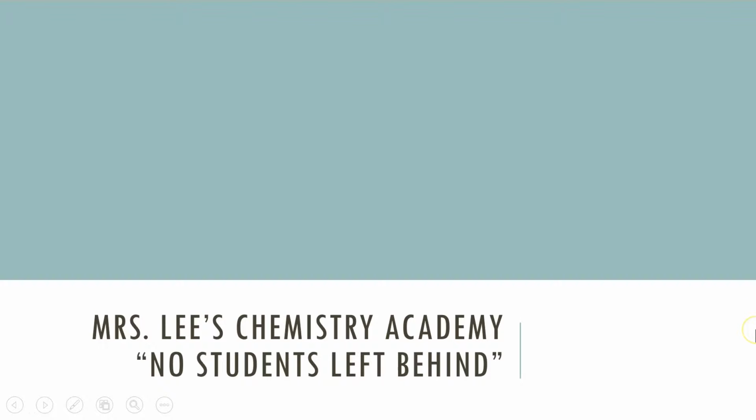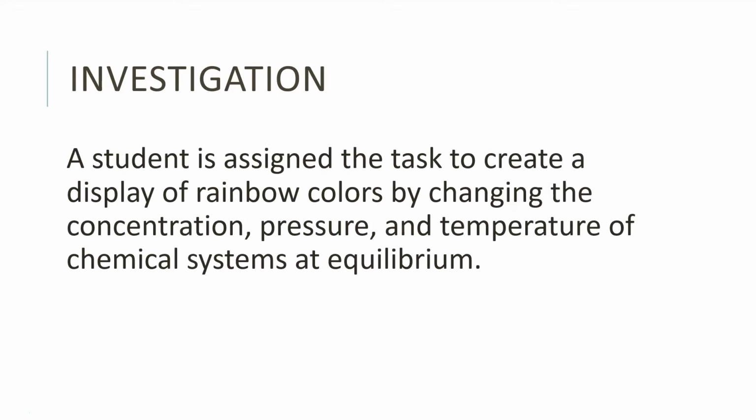Miss Lee's Chemistry Academy, Lab 10, Le Chatelier's Principle. Investigation. A student is assigned the task to create a display of rainbow colors by changing the concentration, pressure, and temperature of chemical systems at equilibrium.